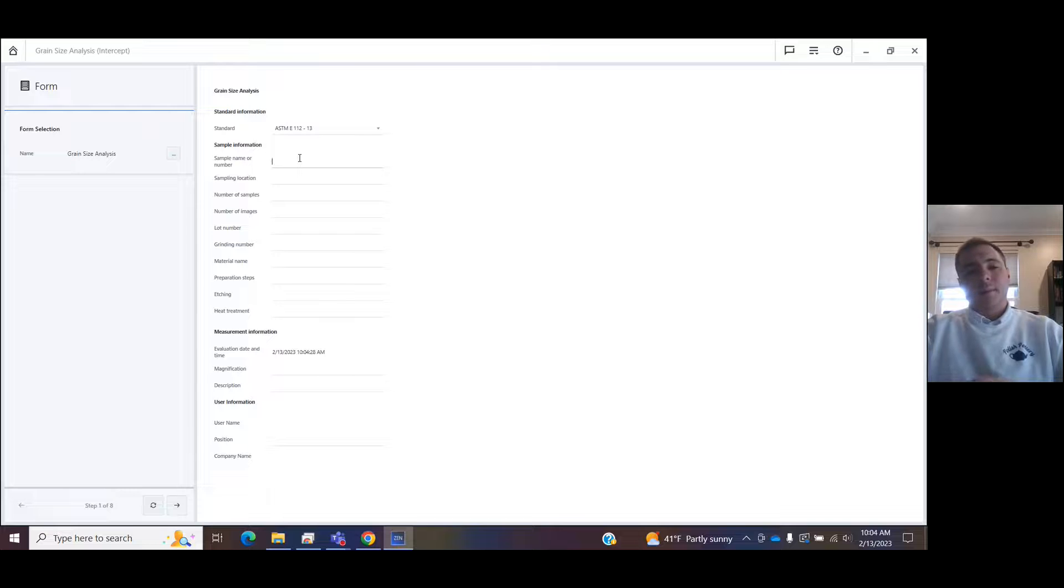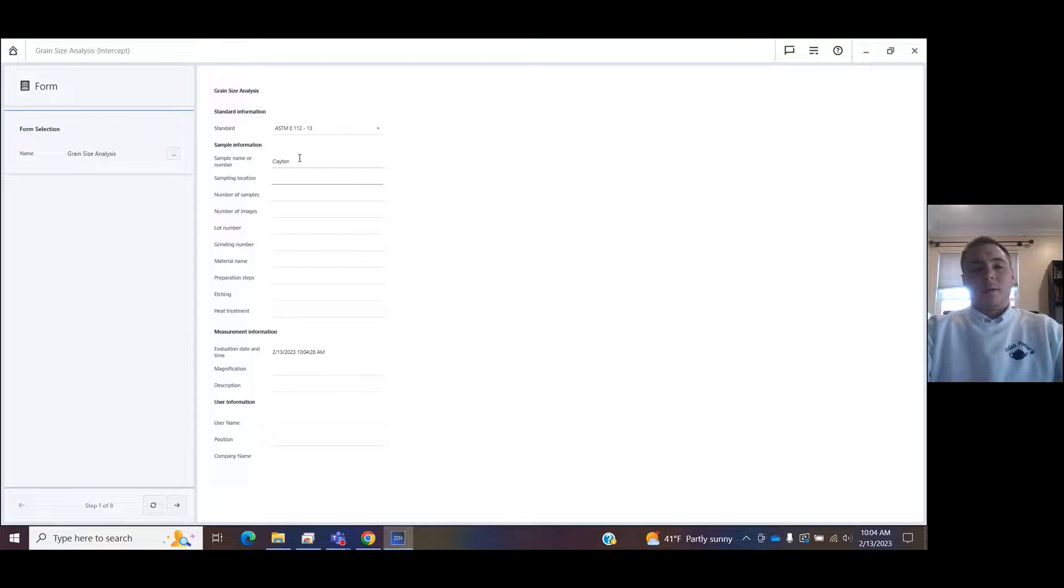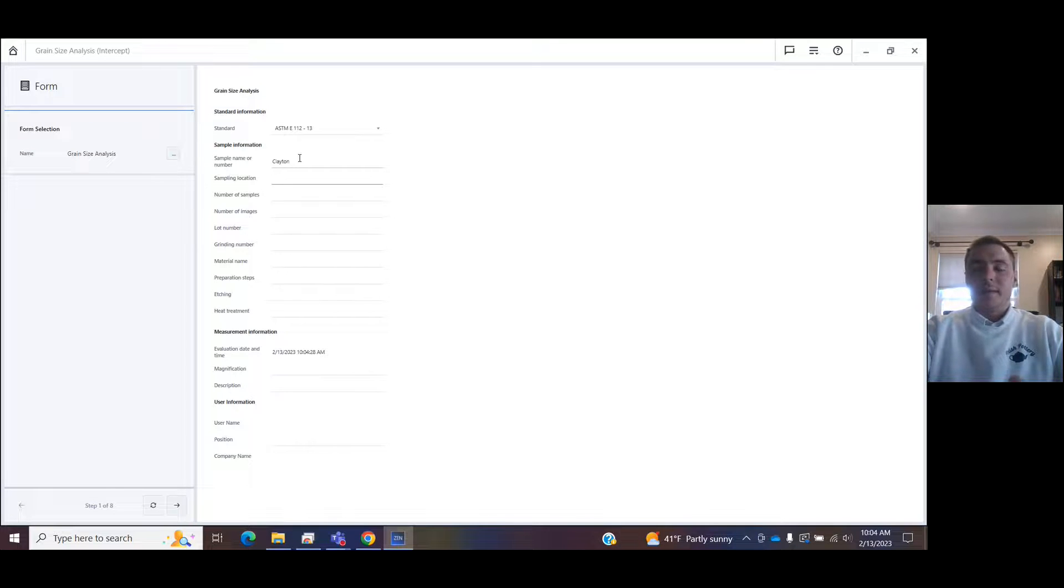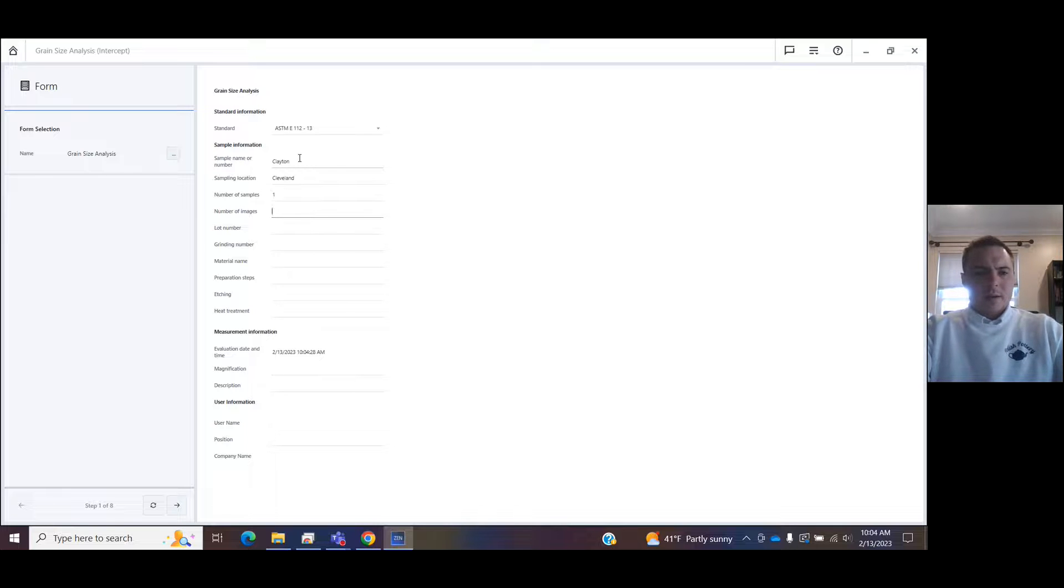It's going to start by giving you a form that you can fill out. These data tables are going to come out in the form of a PDF at the end. So whatever you enter here is just going to make your report look more detailed. So I'll enter some arbitrary stats here.